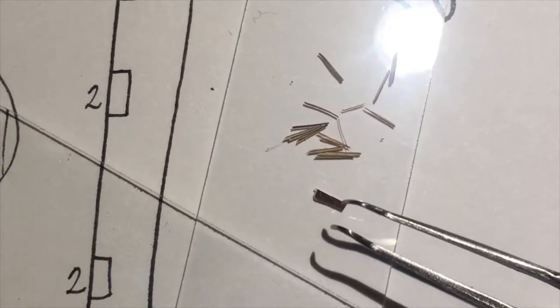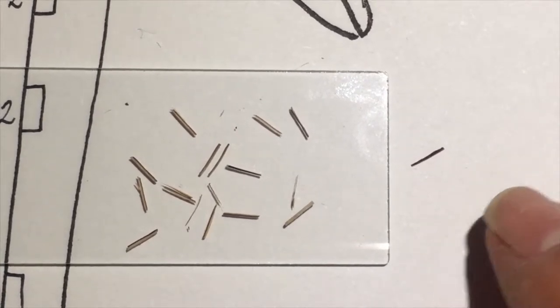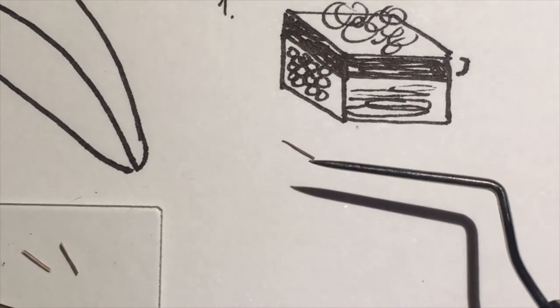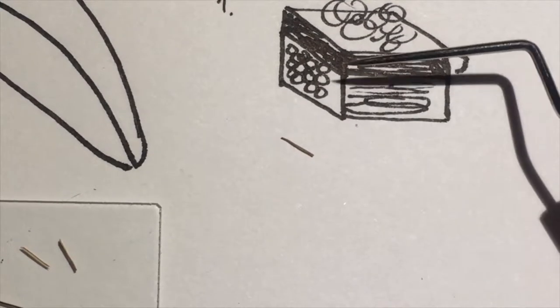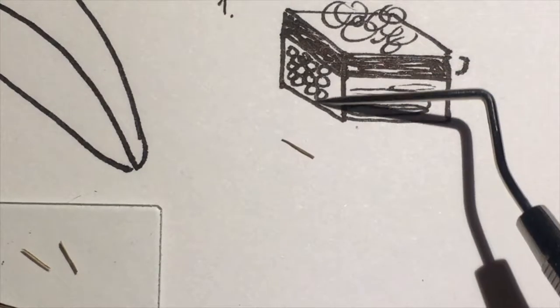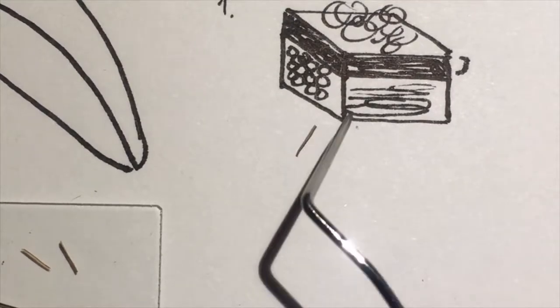Now that I have this piece, I'm just going to leave it to the side because I don't want it. Now the problem when they're too thick is that they don't land flat. Let me see if we can use this image. This one is so thick that instead of landing so that we see this face, we're seeing the very top part. It's too wide. So you always want to make sure that this has more area than the top part. And the only way to do that is to make sure you have very thin sections. In this case, this one's very, very wide. So this is a for sure discard.